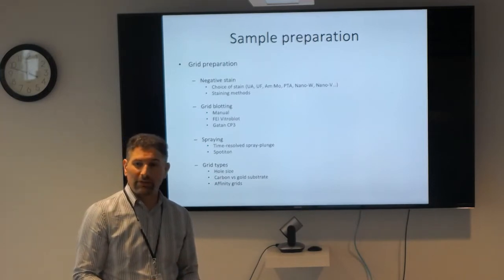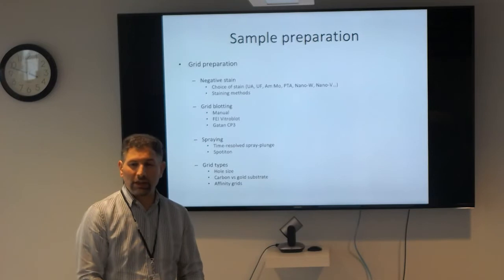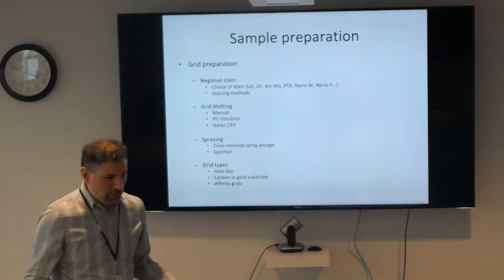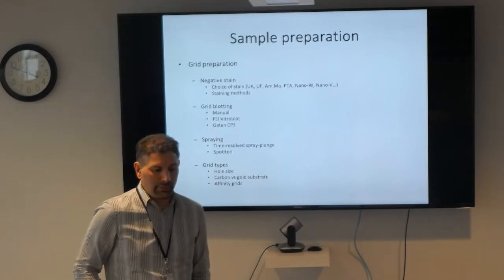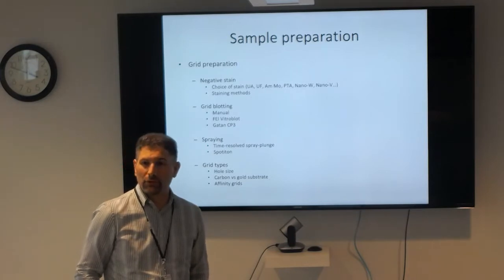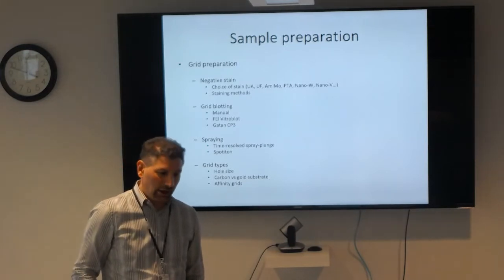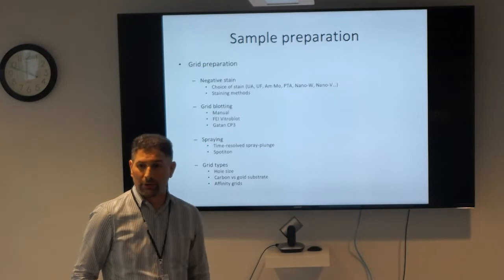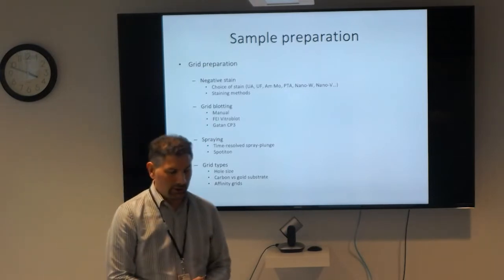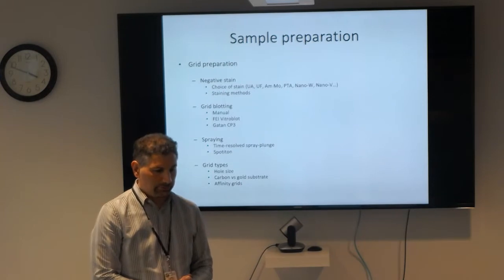And because the carbon is thin and you have a big particle, you can get enough signal to get you to better than 3 angstrom resolution. So this is possible. The smallest thing we tried it on was the 1.5 megadalton, but I'm pretty sure it'll work with something like 700, maybe 400 kilodalton. We tried it with something at 225, and it didn't work out very well. You can see the particles, but the alignment didn't work out.